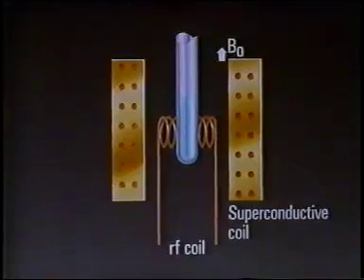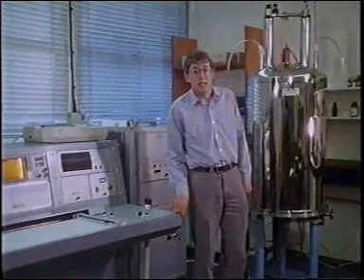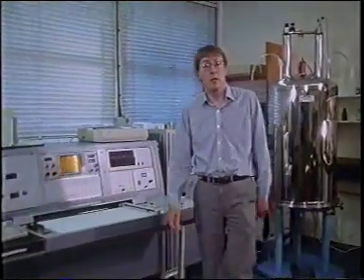The net magnetization of the sample, aligned with the field before the pulse was applied, is tipped through an angle, often 90 degrees. The coil then monitors the oscillating magnetism as it relaxes back to its pre-pulse equilibrium value. This takes a few seconds.